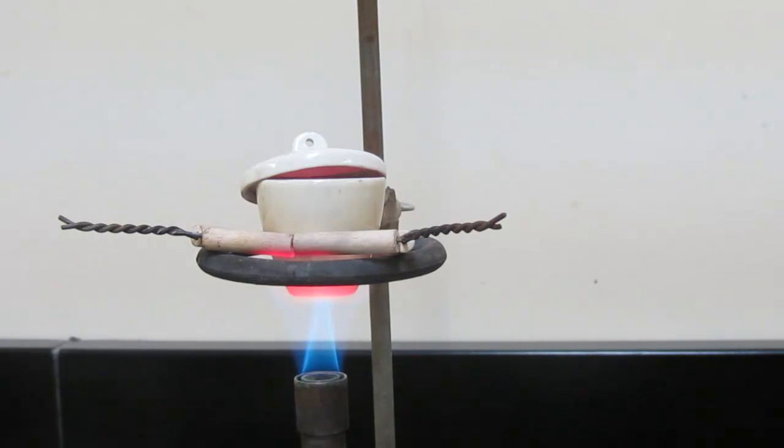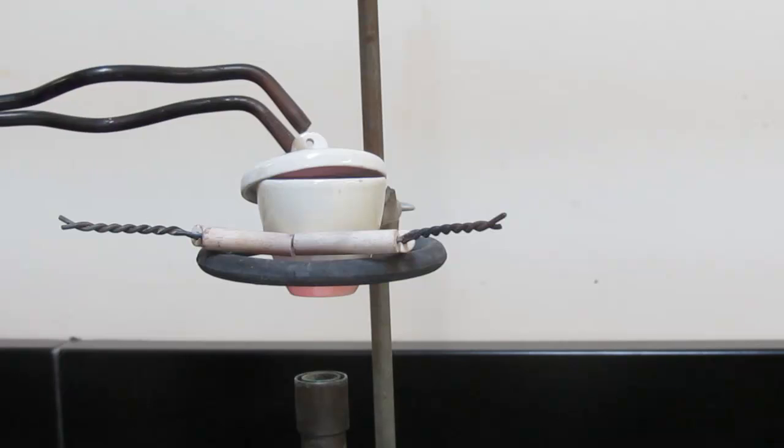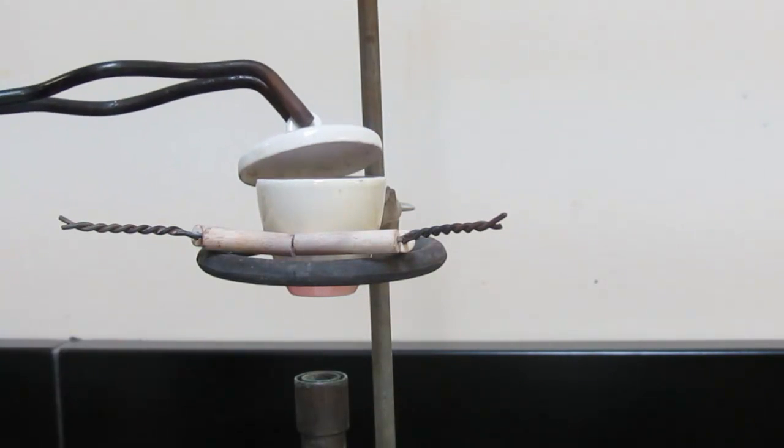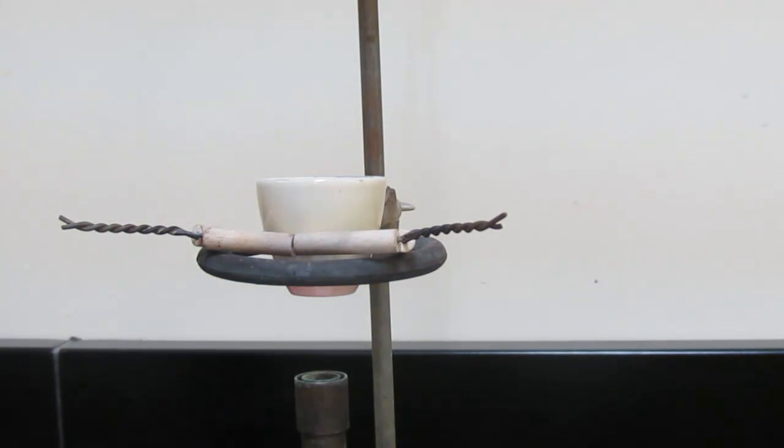So we'll go ahead and shut the heat off now. And we'll shut that off. We can remove the lid at this time. Once again, please use your crucible tongs. This is very, very hot at this time. You will burn yourself quite badly if you're not careful.